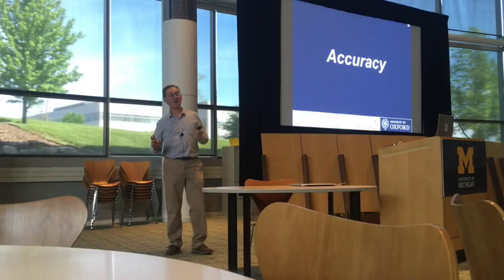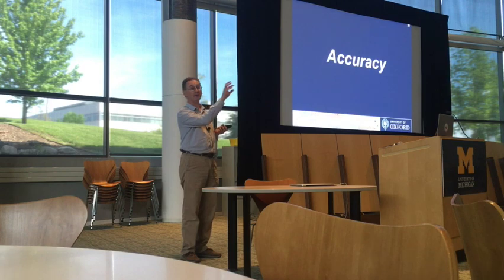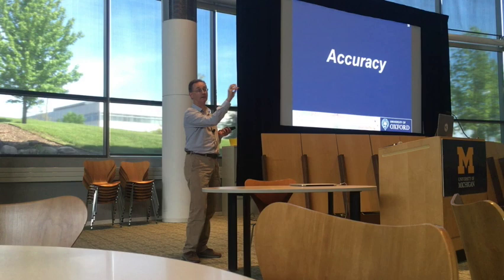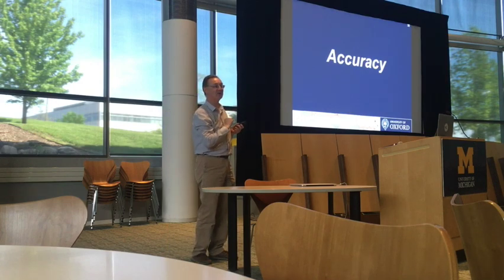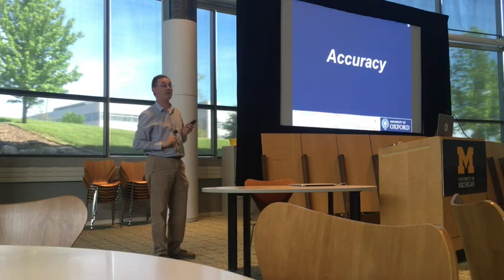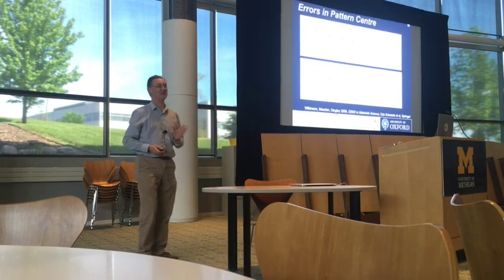Okay. If you imagine somebody playing darts in a pub, you should think about the precision as to how the grouping of the darts on the board will end up. A tight clustering of the darts on the board is good precision, but of course they may or may not be tightly clustered in the right place. Okay? And the accuracy tells you whether that cluster is centered in the right place or not.